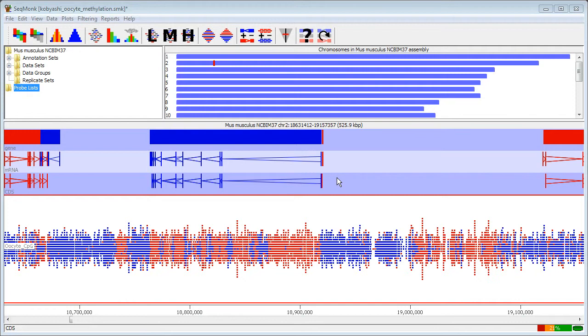The advantage of the quantitation trend plot is that whereas the original trend plot was limited to simply measuring read depths from raw data and their patterning over probes, the quantitation trend plot allows you to do this with any kind of value that you can quantitate.